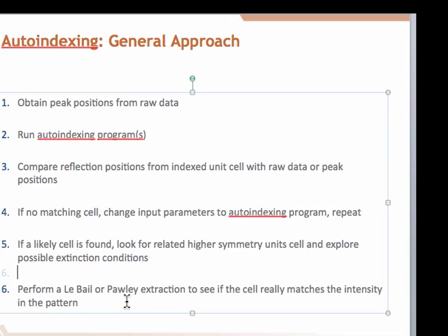So looking at the R factor, you expect when you remove an extinction condition, even if the extinctions are really there, the pattern fit will be slightly better because you'll be able to better fit the noise. But you should see a significant change when you get to a point where you're removing symmetry that's really needed. Okay, so let's get started on actually running CMPR.